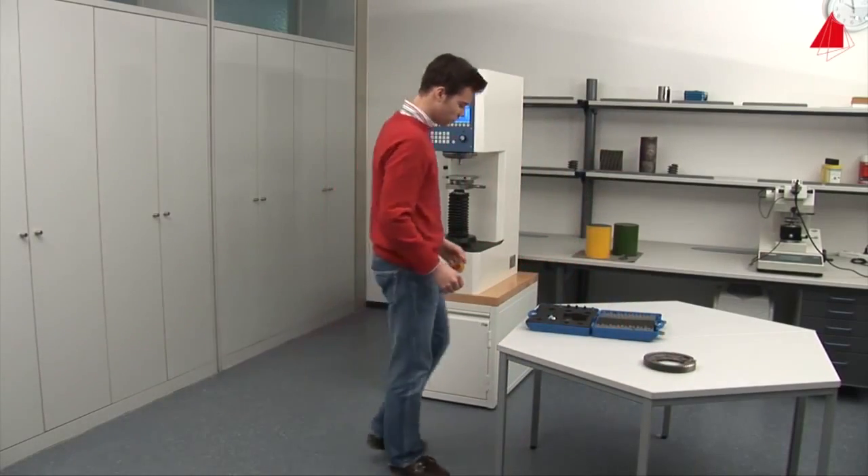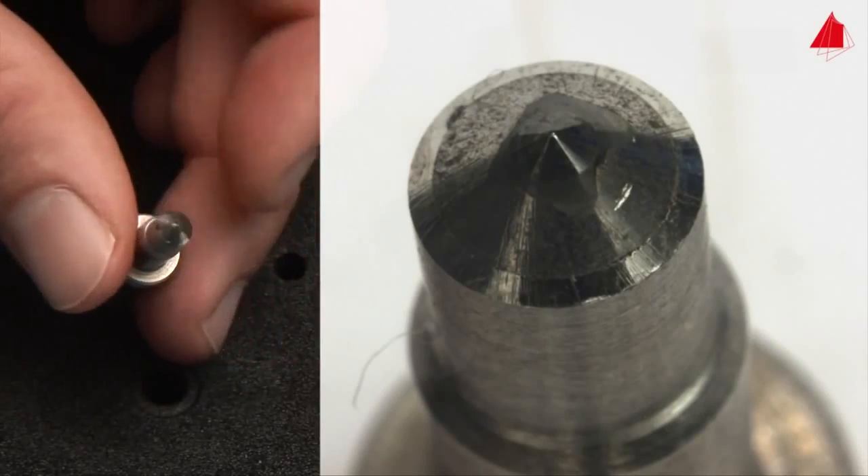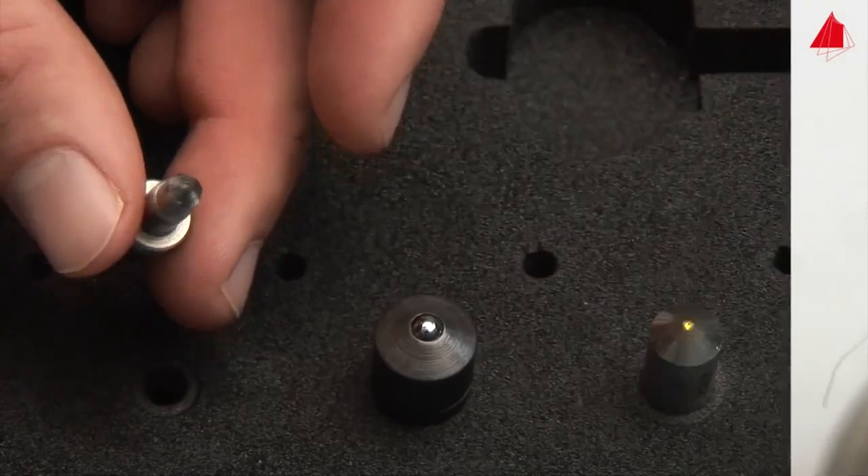Let's take a look at how the test is carried out in practice. The tester selects the conical diamond indenter and installs it in the testing machine.